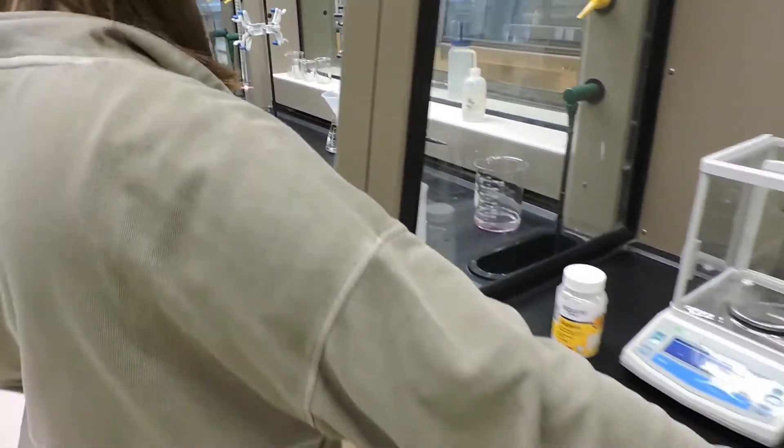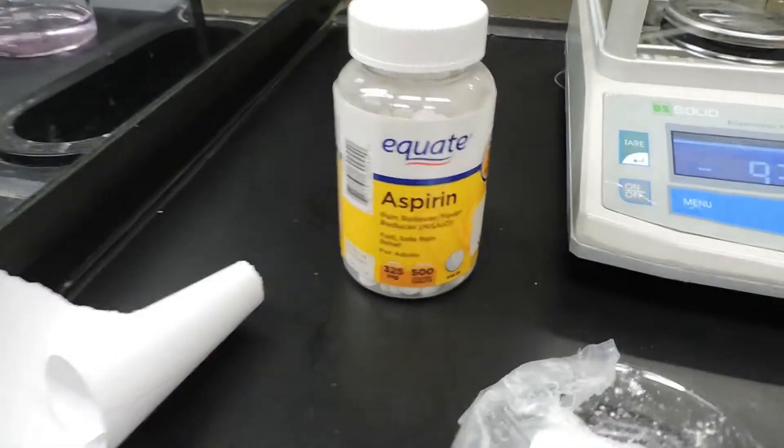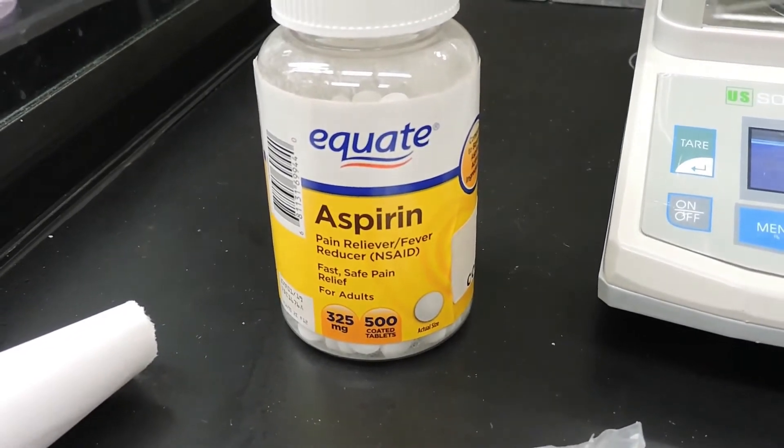Now that we've performed two trials of titration for our synthesized aspirin, we'll also do a titration of commercial aspirin to compare and see how our aspirin measures up to the commercially produced aspirin.